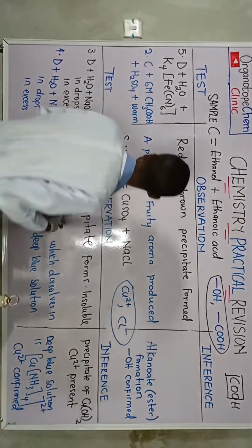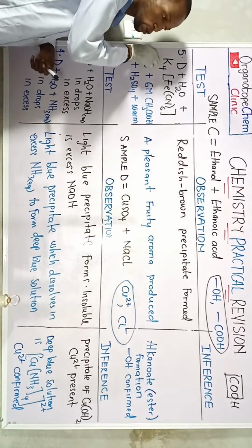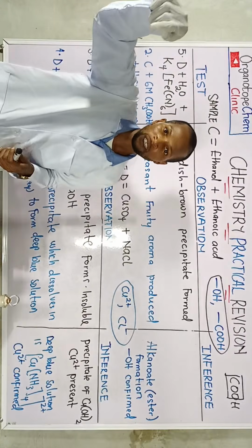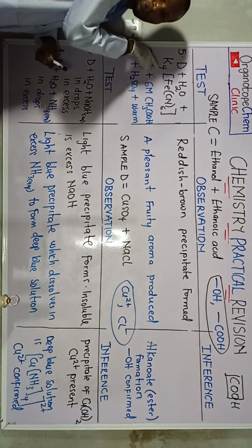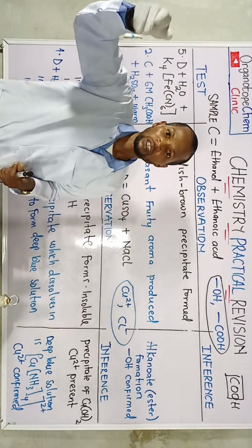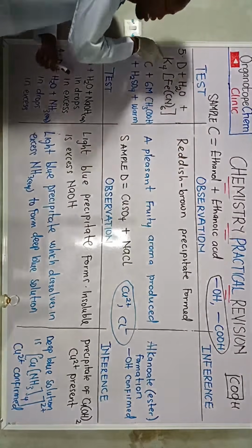Now, for the precipitate formed, you know that potassium is found in group 1 in the periodic table, and the oxidation state of the copper is +2. So if you are having group 1 elements with subscript 4, the copper that is replacing it has an oxidation state of +2. So 4 divided by 2, that is 2. So it will be Cu2 in place of K4.